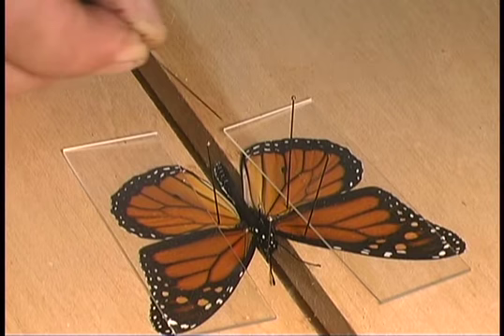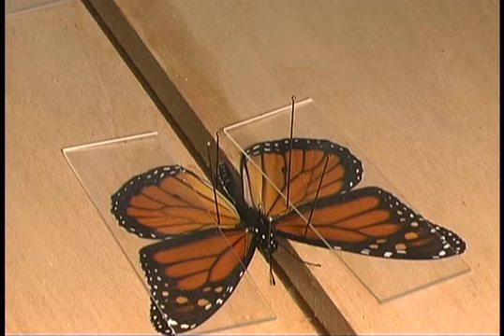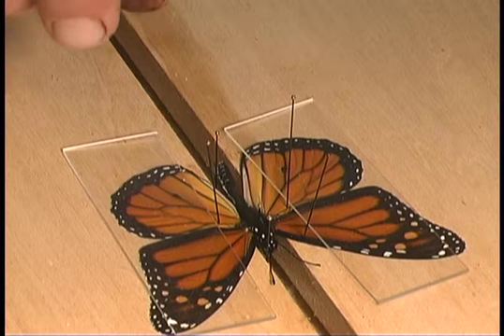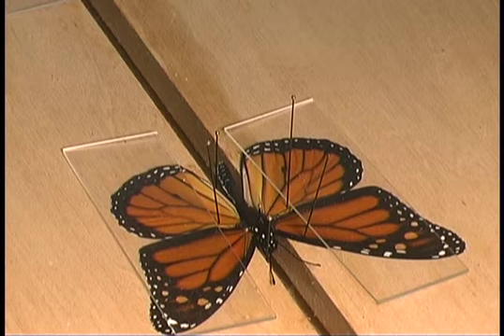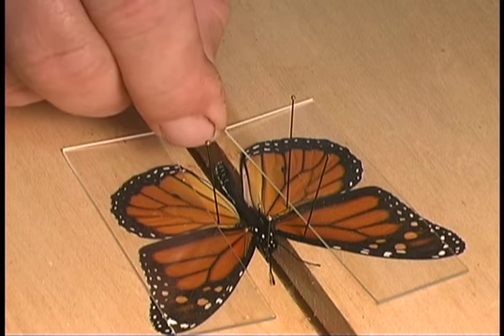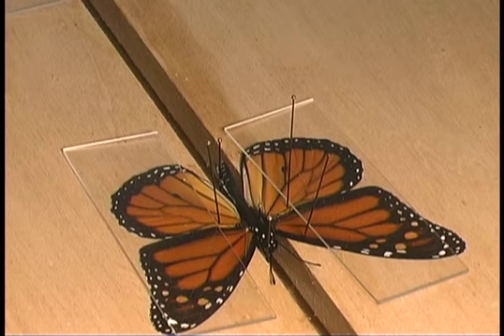Also make sure that you position the abdomen so that it is as straight behind the thorax as possible. When inserting the Lepidoptera into the mounting board, push the specimen down into the groove far enough until the point where the wings attach to the thorax are perfectly even with the edge of the board. When positioning the abdomen, do not pin through it — instead support it by placing a pin either underneath or to the side of it and moving it from one edge to the other.